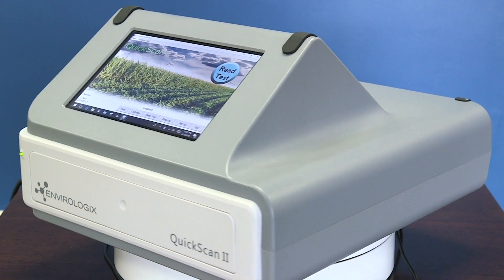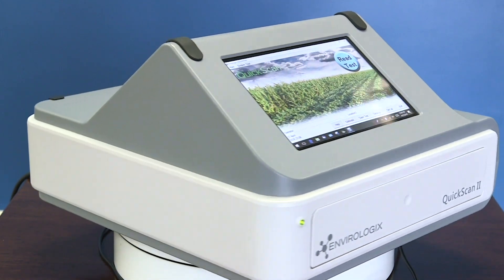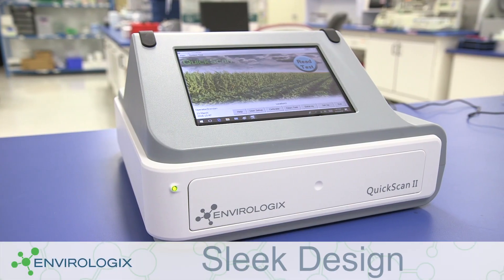We're pleased to present Quick Scan 2, harnessing all the capabilities of our leading software solution in a new sleek and streamlined footprint.